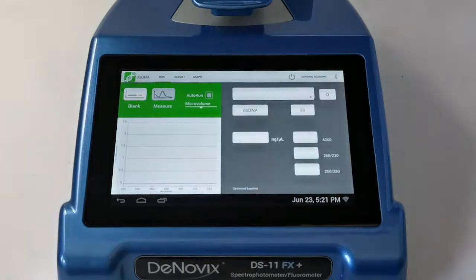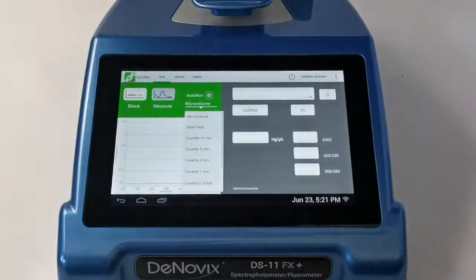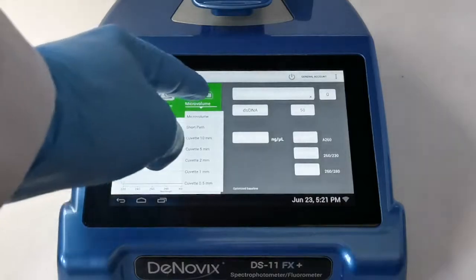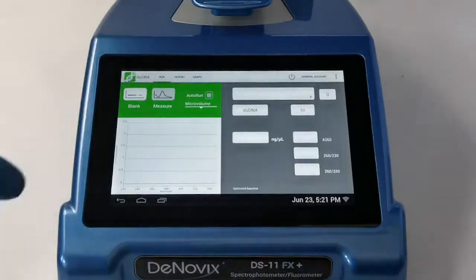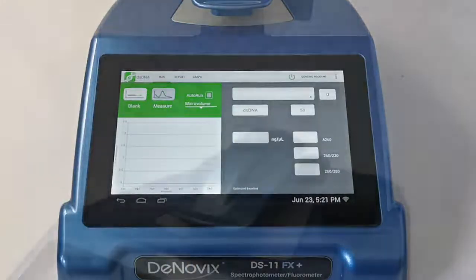We can see we have an auto run feature, and this just allows us to automatically run a sample without touching the measure button as the arm closes. So if we've got a big batch of samples, it's a nice little time saver. And I'll show you how that works during the process of the demo. We can choose between microvolume and cuvette mode using the drop-down menu. And on the right-hand side, this is where our data will appear.